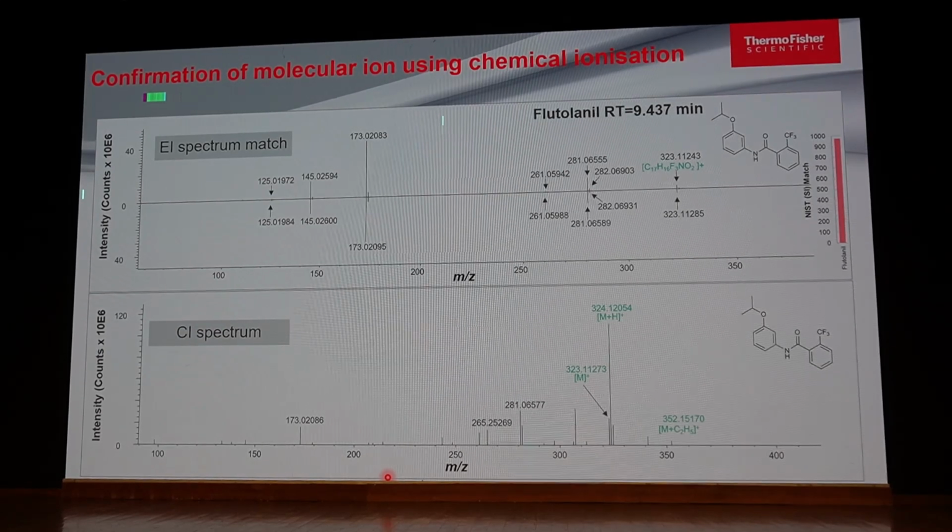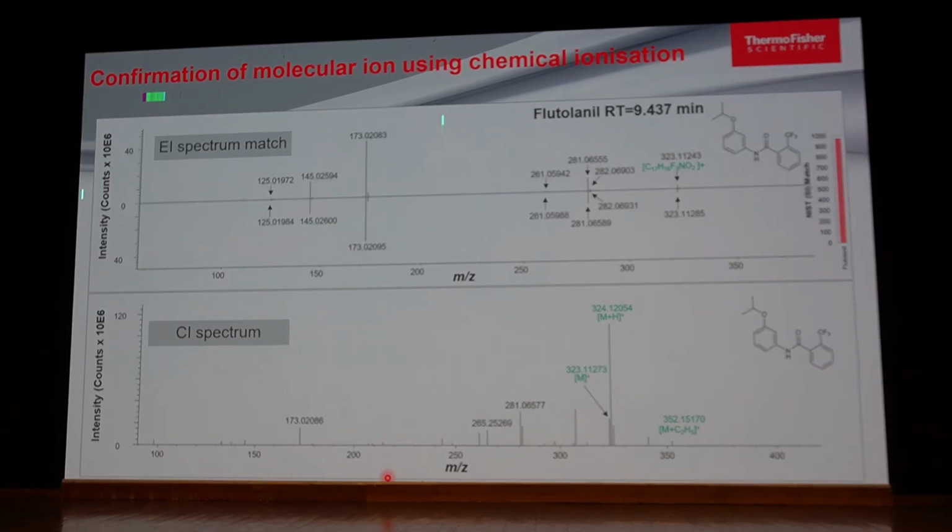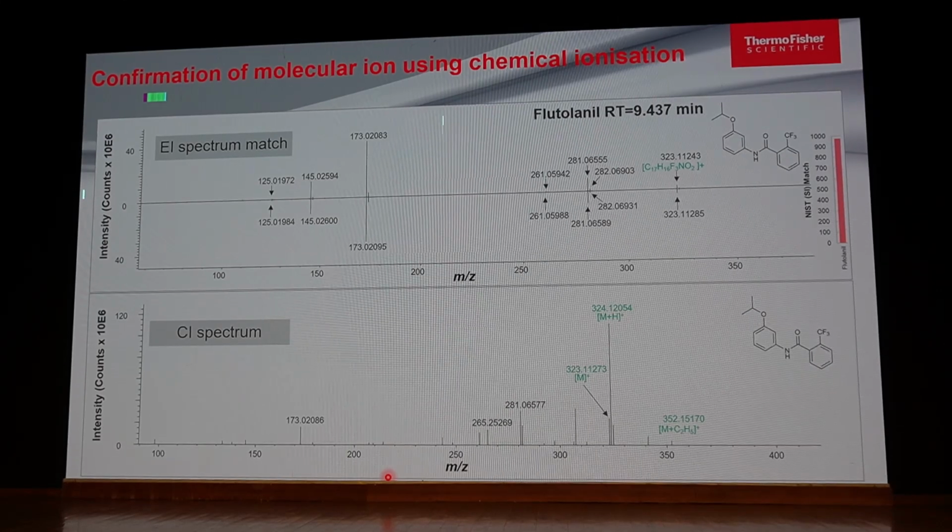There is also a new approach coming with NIST exact mass, and for some targeted pesticides or environmental contaminants, a library is there which can give you exact matching with respect to exact mass also. Parallelly you will get the calculated molecular formula. Based upon that you can generate more and more confidence about what type of structure we have and the information about the compound.